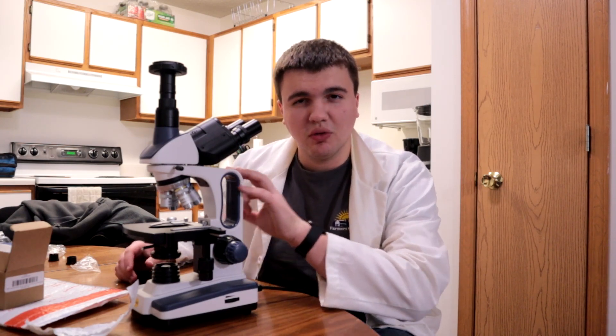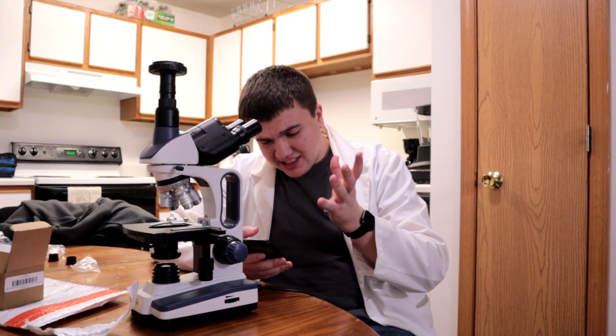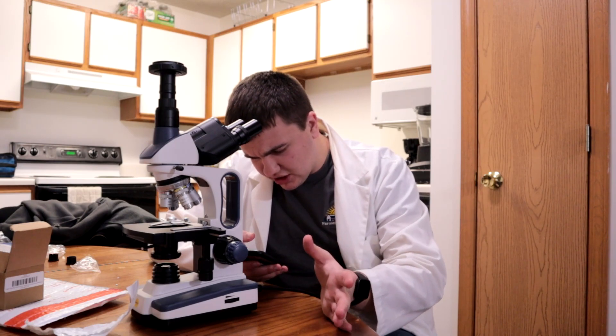Today, we're working with the microscope once again. But today is an unboxing and review of the AM Scope Canon SLR DSLR Camera Adapter for Microscopes.